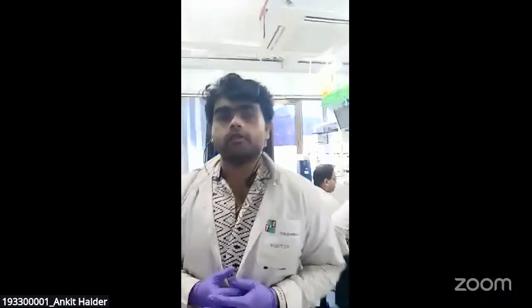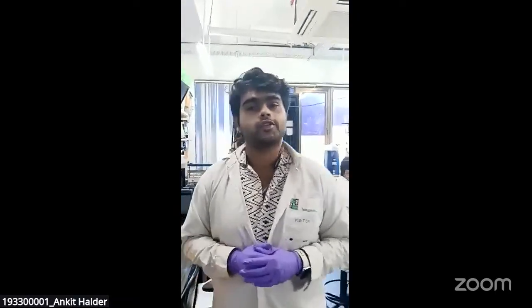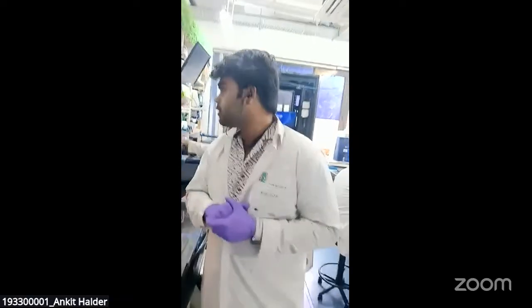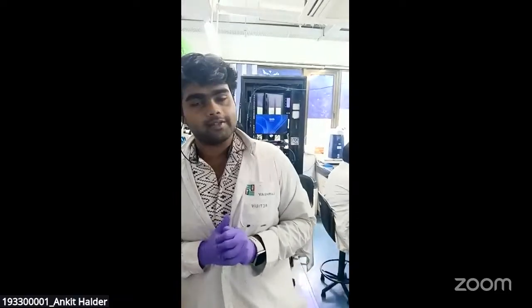So good morning all. Welcome to the MOOC live session. I am a TA for the Introduction to Proteomics course. So today we are going to learn how we can digest the proteins into peptides, so that we can analyze them by mass spectrometry.